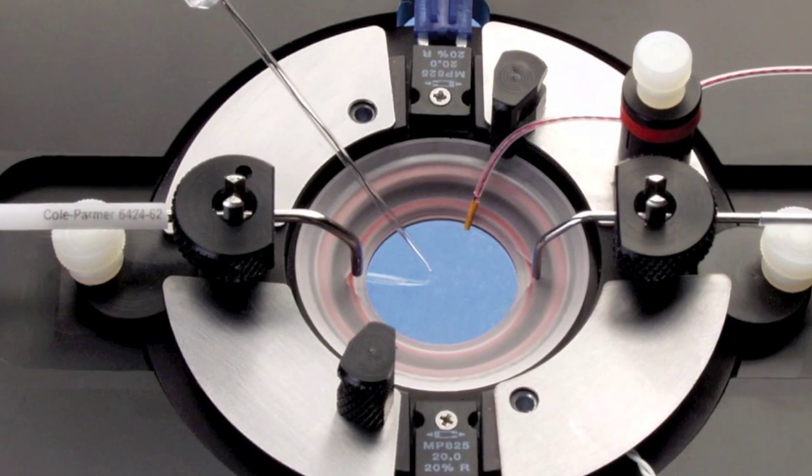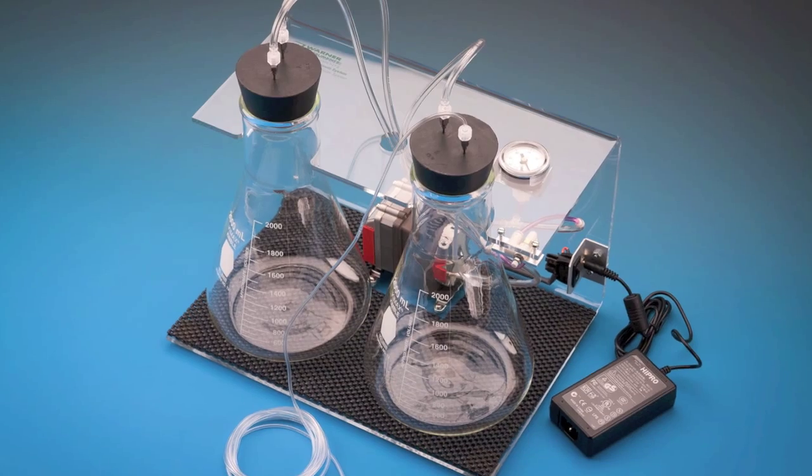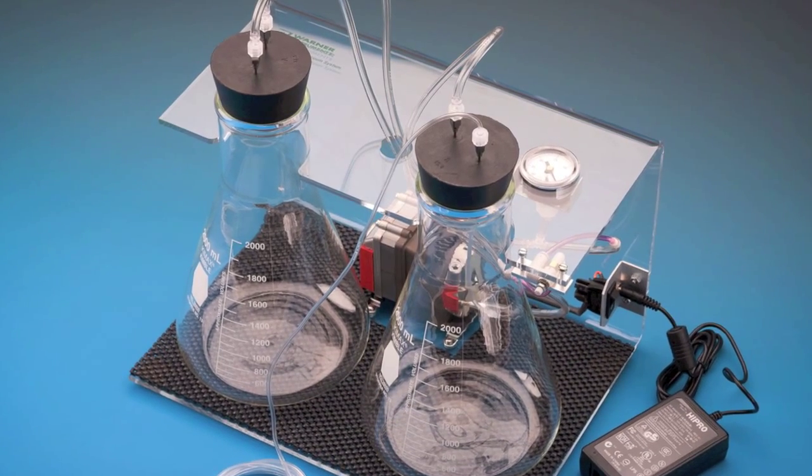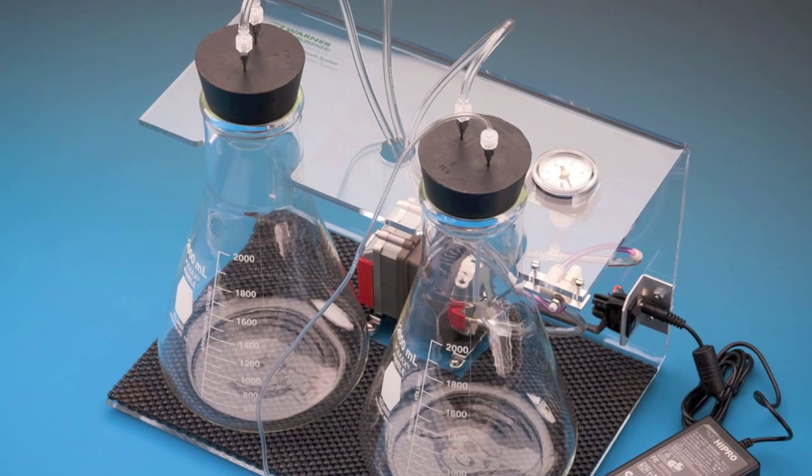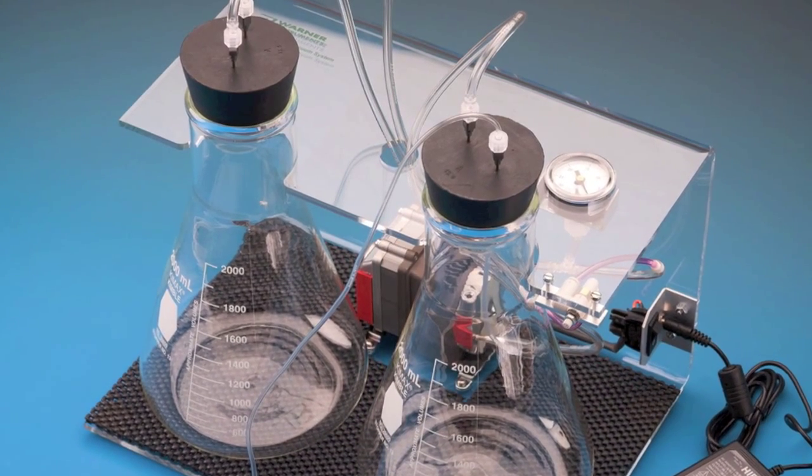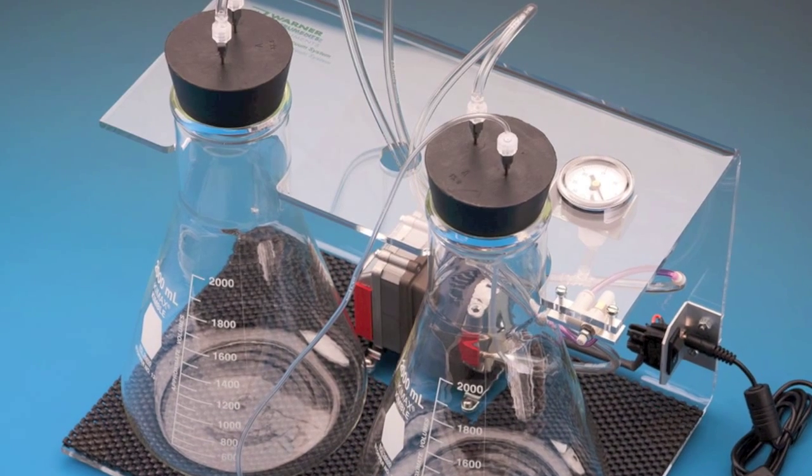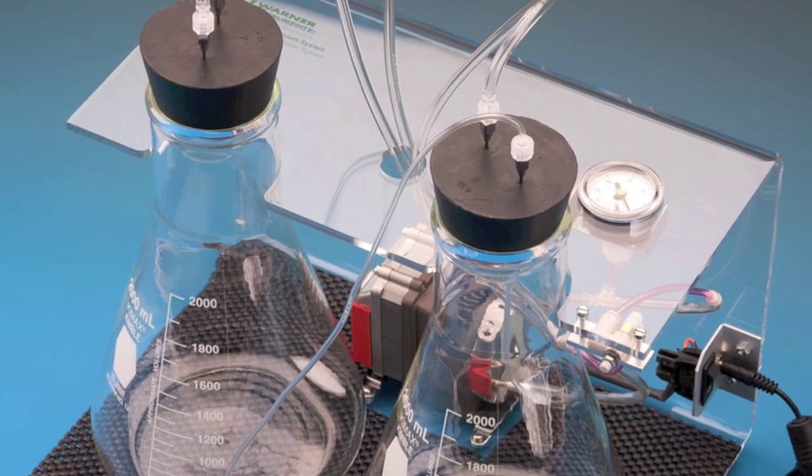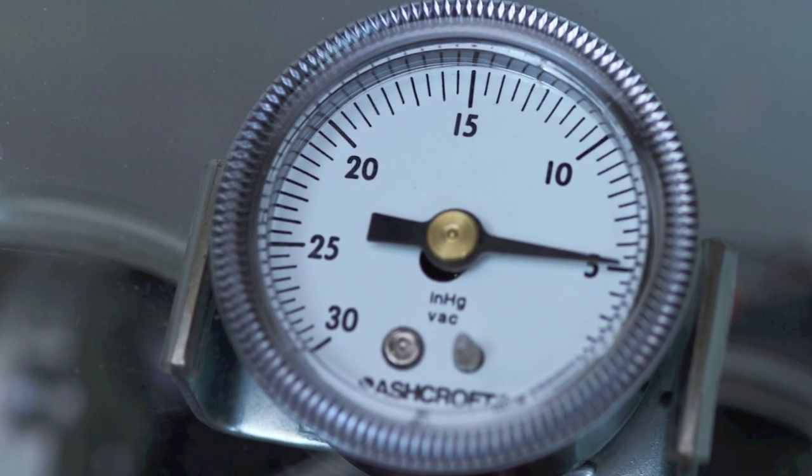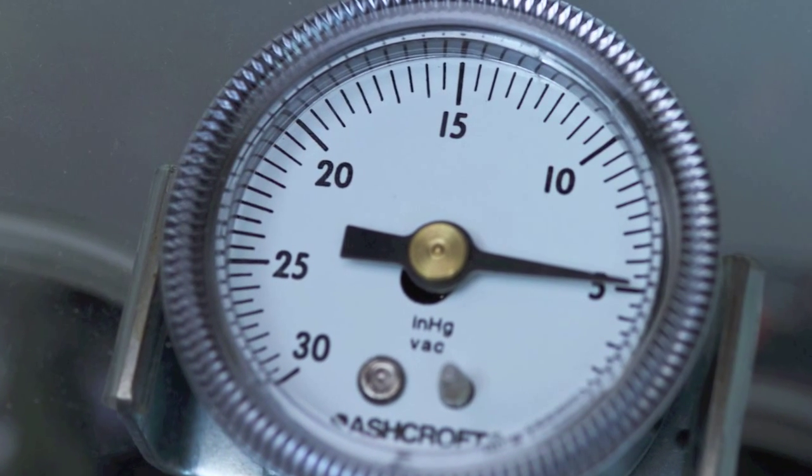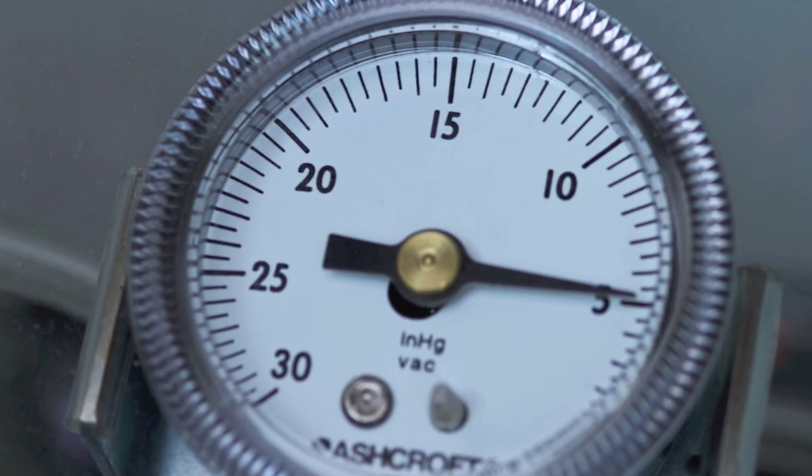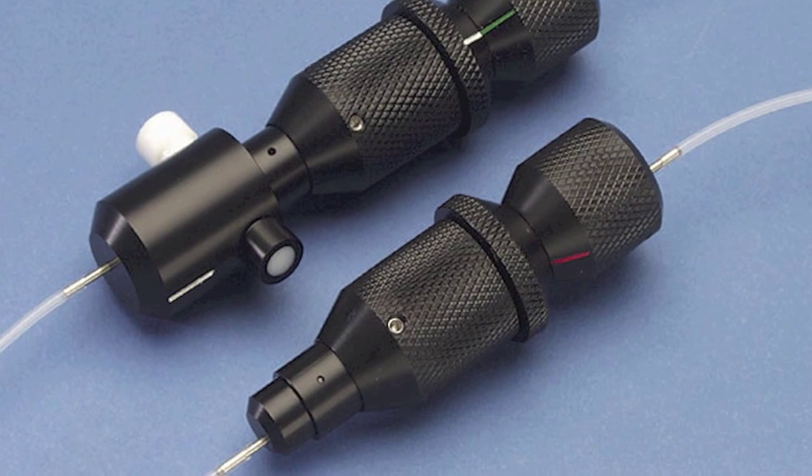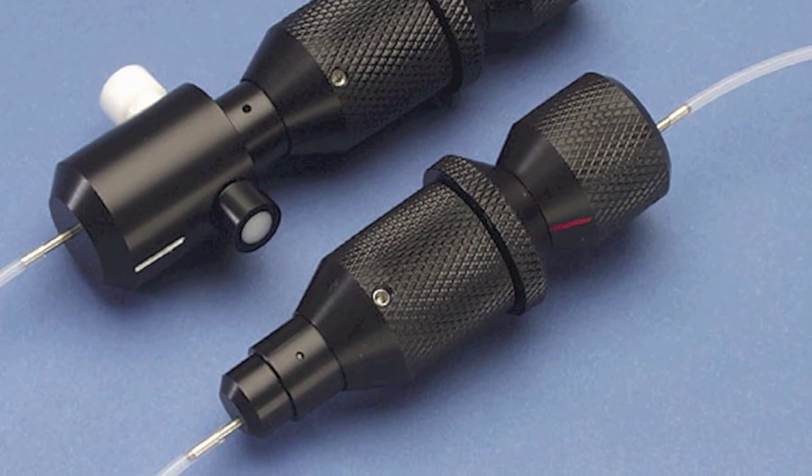Aspiration quality is critical to the mechanical stability of preparations within perfusion chamber systems. As such, an ideal vacuum generating tool is provided by our dedicated workstation vacuum system. This apparatus employs two vacuum reservoirs coupled with a vacuum pump and a regulator to directly control the degree of vacuum pressure. The two reservoirs provide aspirant collection and pressure buffering. A suction pressure of 5 inches of mercury, approximately 2 psi, is sufficient to maintain steady aspiration pressure and consistent aspiration of the bath.